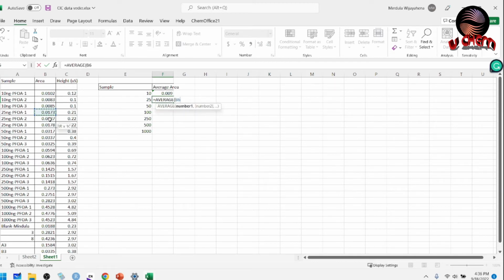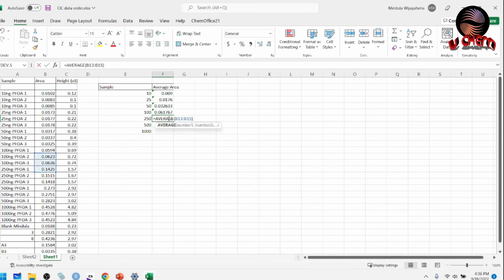You can select the 3 again. Alternatively, you can select this and drag down, but it only shifts by one square, so you can select it and take it down, then do this again and take it down, and again.